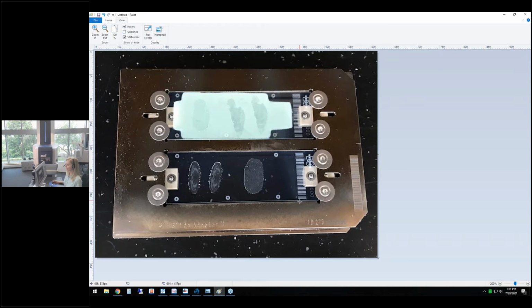These are already inscribed with the barcode to the right, and they also have inscribed fiducial marks, the teaching marks, which allow us to automatically co-register the IntelliSlide with our mass spectrometry image acquisition software.